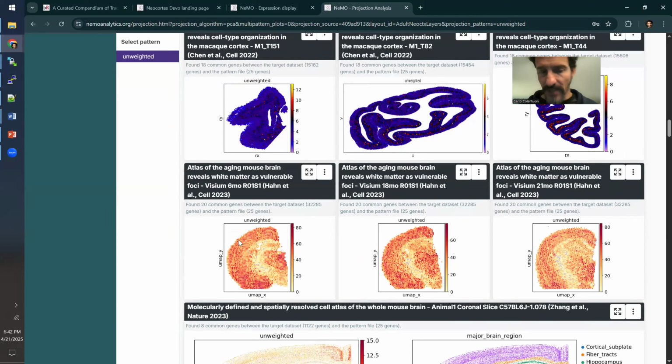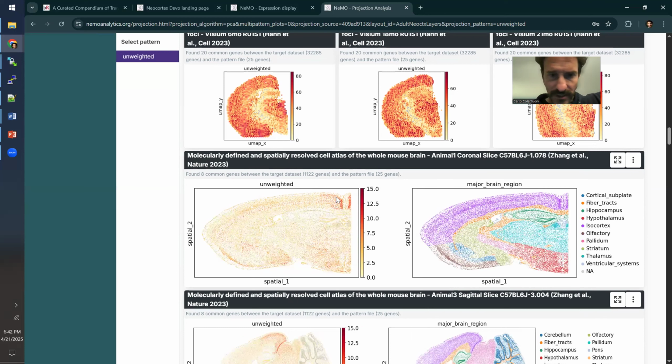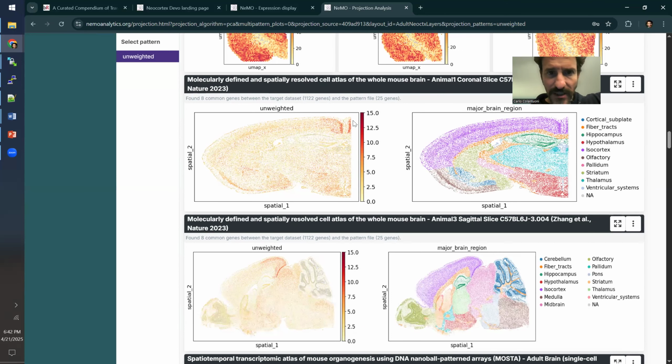And this is really where the observation that this is likely to be primate specific came from. Not this data in particular, but when the Ma et al. study looked at non-primate mammals, they didn't see it either. So there's nothing here in the mouse, but this newer study that has a little bit more high resolution expression data, also spatial transcriptomics, shows us that there may be some very specific pieces, and this looks like perhaps cingulate here. There may be some cortical regions in the mouse where it actually does appear.